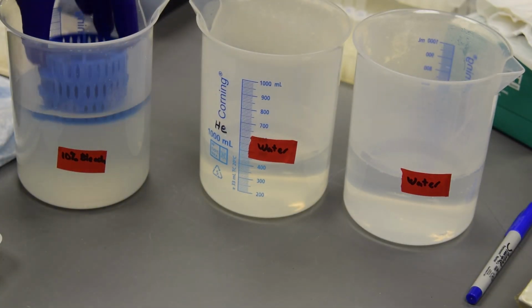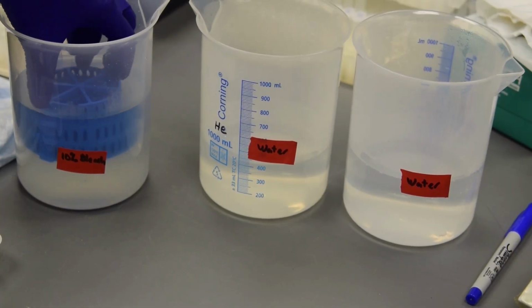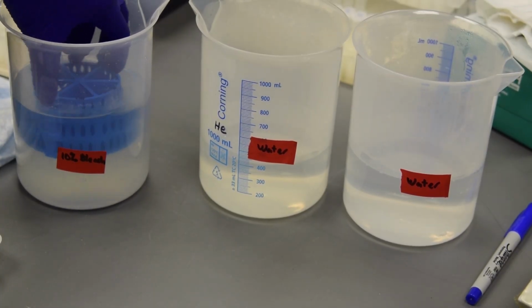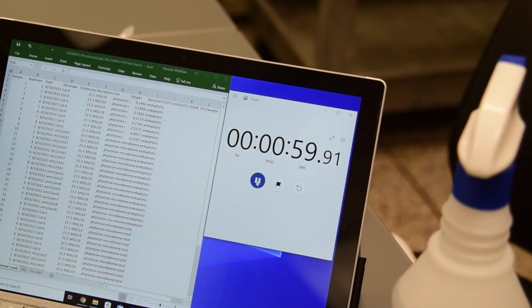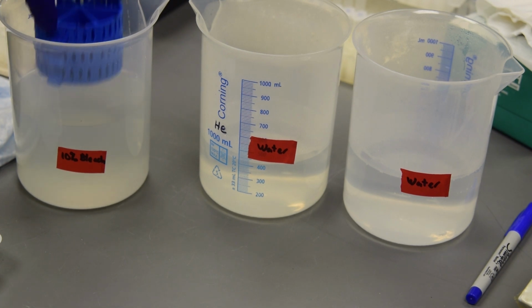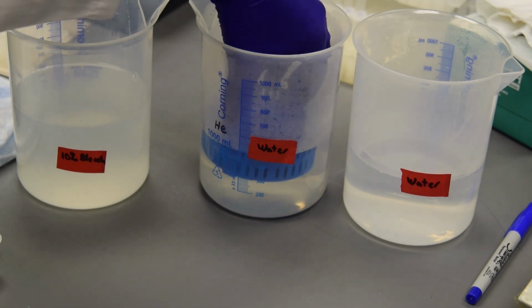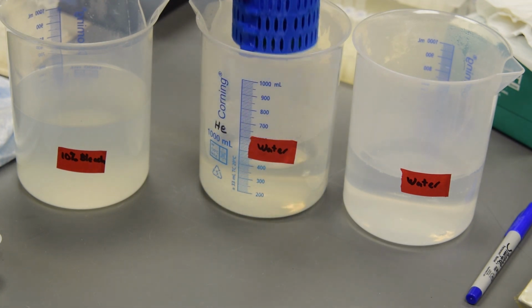Soak the leaves in 10% bleach, 0.6% sodium hypochlorite, for 1 minute with light agitation. Briefly shake off excess liquid, then place in sterile water and agitate. Repeat in a new beaker of sterile water. This should wash away the remaining bleach.